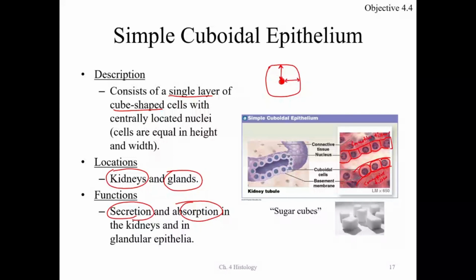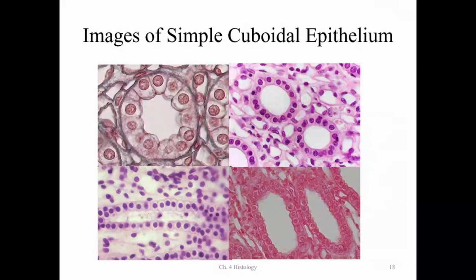All right. So let's take a look, and I think sugar cubes. Here we have them, and what I like to do is describe it like this, guys. The tissue we're looking for is right here. Now let's imagine you took a toilet paper tube and looked at the open end.